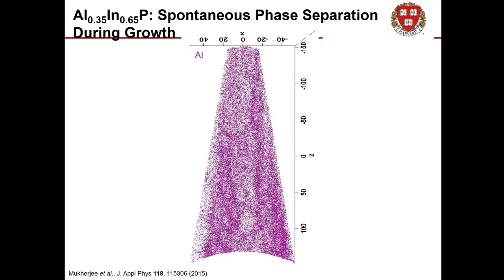The TEM data that we showed with its fluctuations is taken from a TEM lamella. TEM lamellae are thin membranes of the original material, but they are not of infinite thinness. They have some finite thickness. In this case, they were about 70 nanometers thick. If you imagine a transmission measurement that passes through this volume and out the other side, it is going to average together all the fluctuations that one can see over 70 nanometers. That is why the extracted fluctuations were so small.